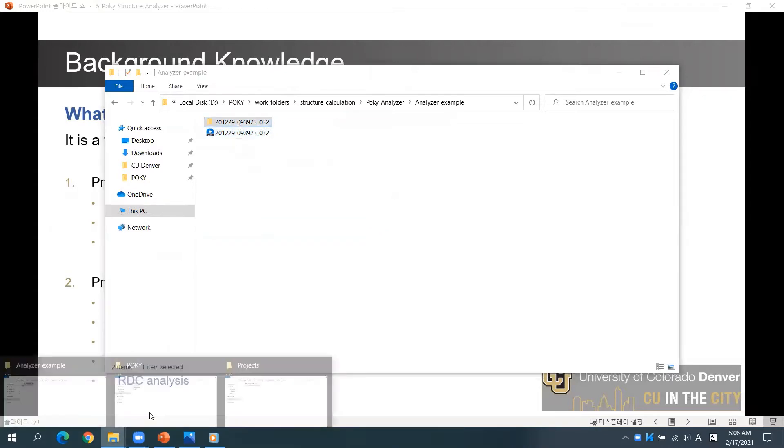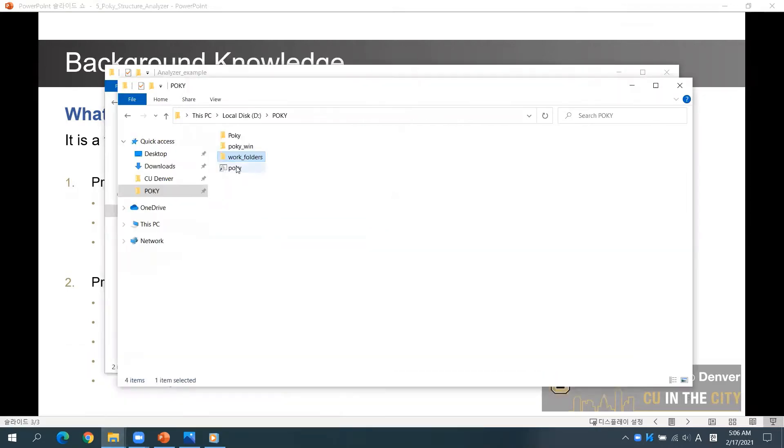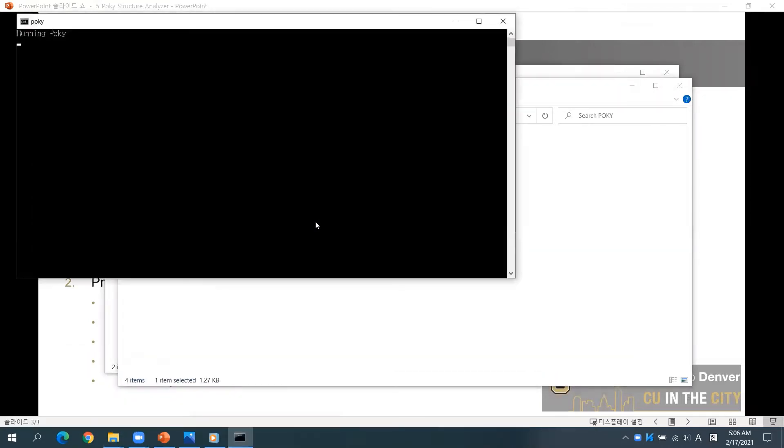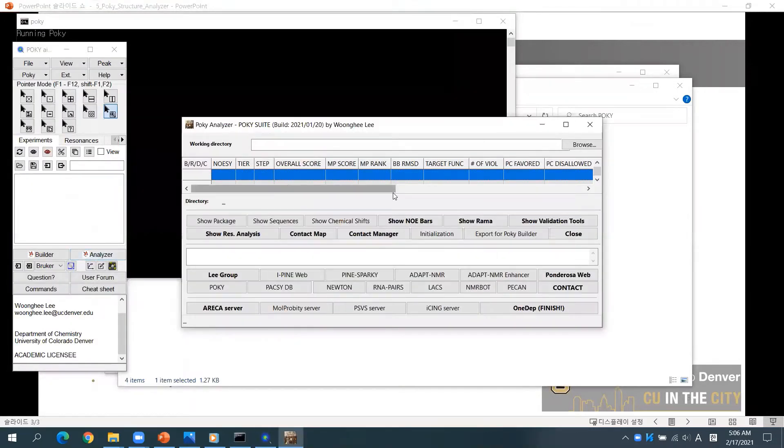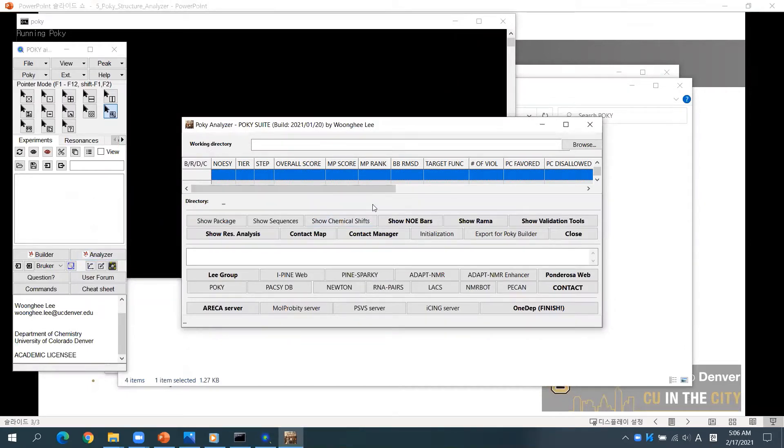Run POKI and click Analyzer button. If you are familiar with Ponderosa Analyzer, you can easily use POKI Analyzer as well. If you are a beginner, please follow this video.